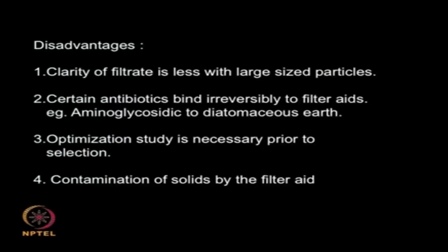So the disadvantages: the clarity of filtrate is less when you use large size particles. If you have antibiotics, these antibiotics may irreversibly bind to the filter aids and then you will not be able to recover the antibiotics. If that is your desired product, you are losing your product in the filter aids.